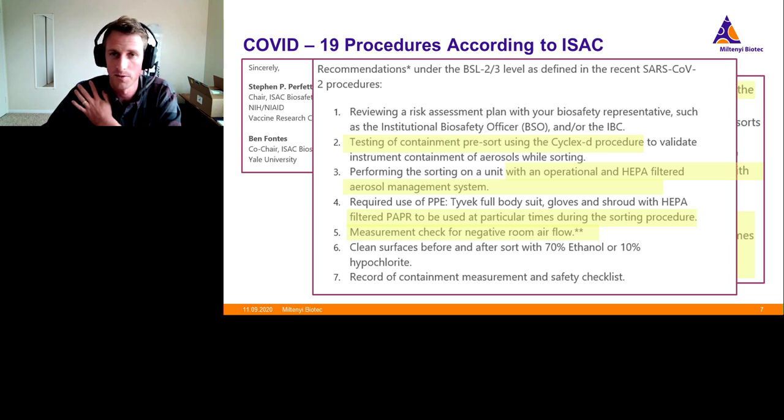Many labs are equipped to do HIV sorting and things like that, but with the excitement about working in this field, there are a lot of people entering the space that may not have the same level of expertise or the same infrastructure. And so eventually we settled on the ISAC, the International Society for the Advancement of Cytometry, I believe is what it's called.